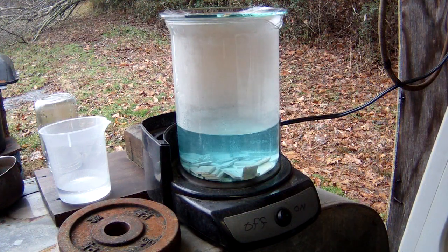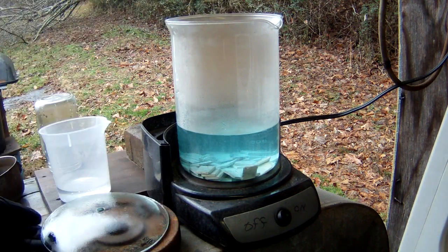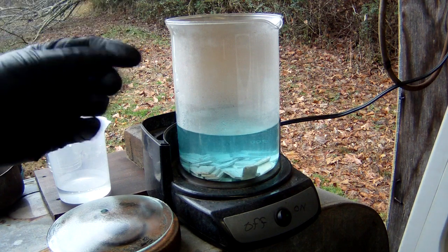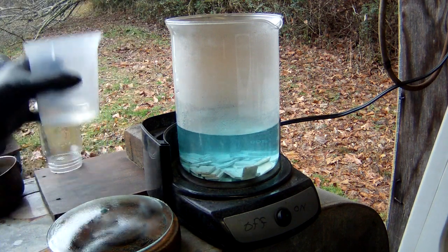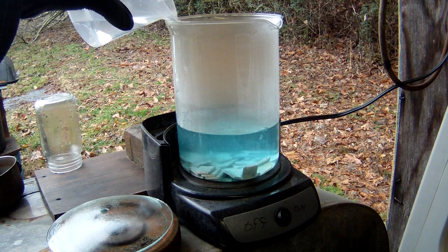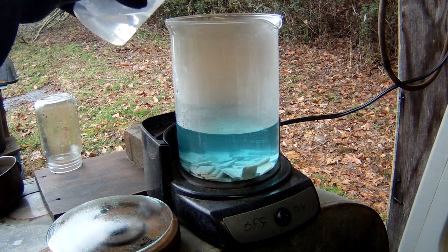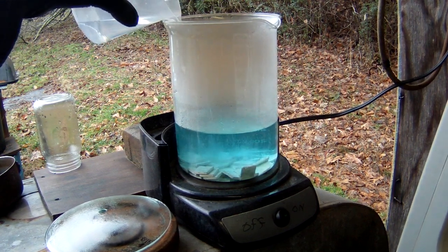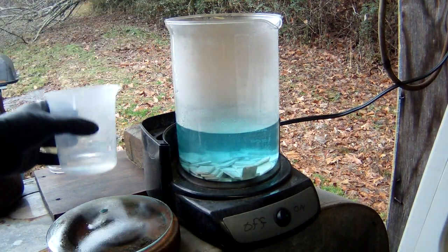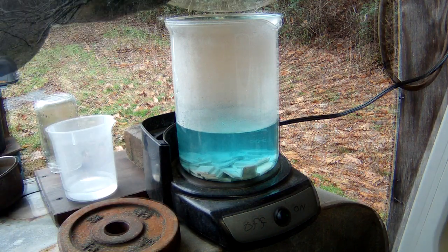Several minutes have passed. As you can see, we're getting a nice light color change — it is blue or aqua blue, not green, so I'm already definitely liking that. We're going to go ahead and add a little bit more nitric. Remember, nitric acid and silver — wear your gloves, or you could end up with very black fingers. We'll put about another 50 mils in here. I actually really like these new little plastic beakers for pouring acid because they don't drip.